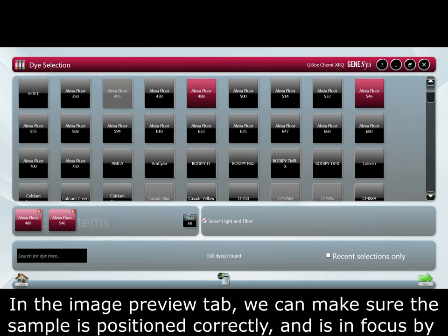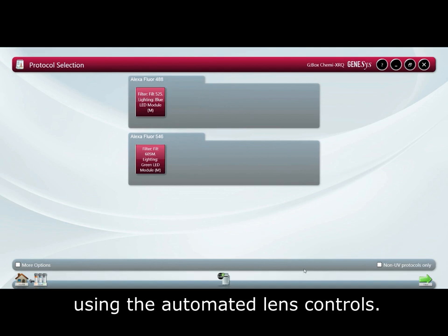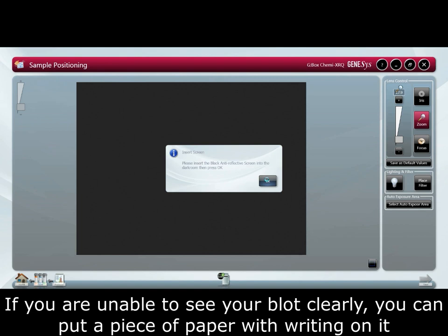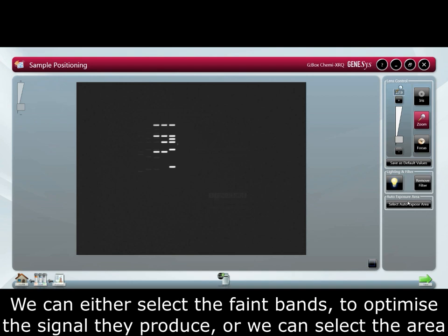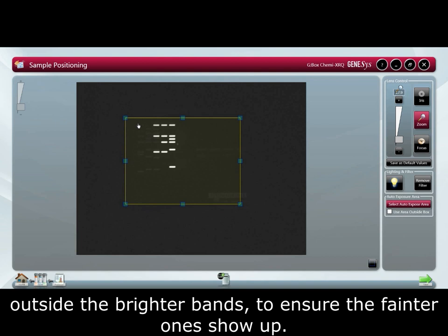In the image preview tab we can make sure the sample is positioned correctly and is in focus by using the automated lens controls. If you are unable to see your blot clearly, you can place a piece of paper with writing on it in the darkroom to adjust focus. Auto expose area is a powerful feature to use if you have both bright and faint bands on the same blot. We can either select the faint bands to optimize the signal they produce, or select the area outside the brighter bands to ensure the faded ones show up.